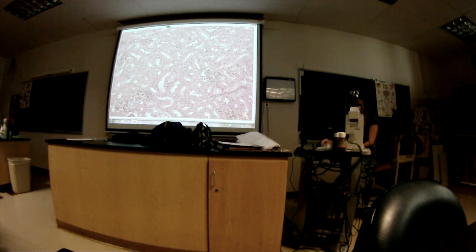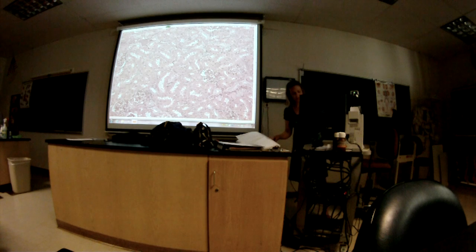Questions about that one before we change slide? Can you accept tube rather than tubule? Convoluted tube? I'm not sure. Probably depends on how I'm feeling that day.